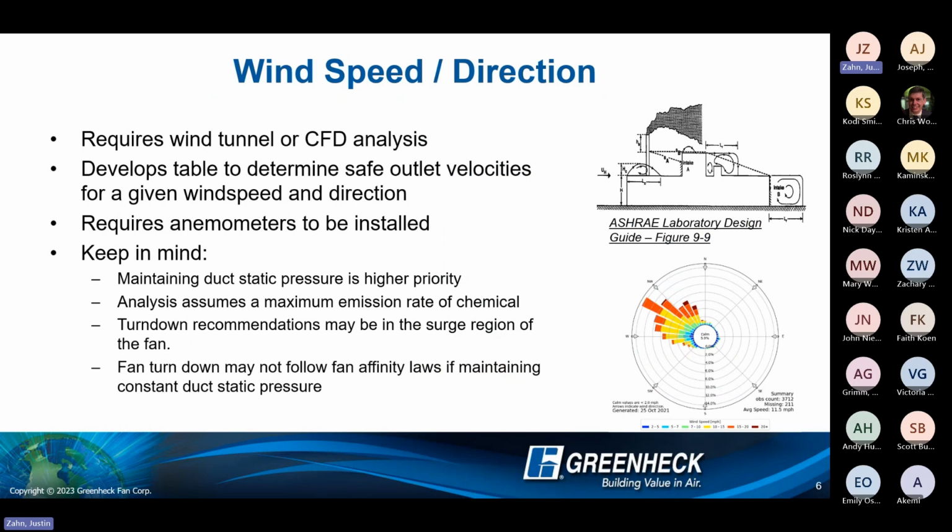So, moving on, talking about ANSI Z9.5 a little bit more and talking about how that standard has changed now in the industry. One way around avoiding that 3,000 feet per minute, if you don't want to take the manufacturer's recommendation, is through a wind-wake analysis. For those of you who don't know what that is, the wind-wake analysis is basically they take a mini 3D printed model fan and place it, let's say these fans are going into downtown Seattle, okay? They would create a 3D printed model layout of downtown Seattle and place that fan within that layout.